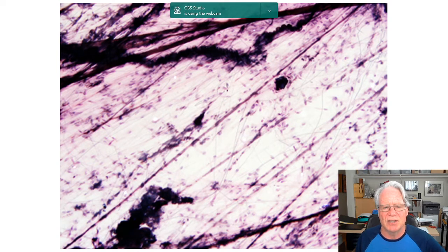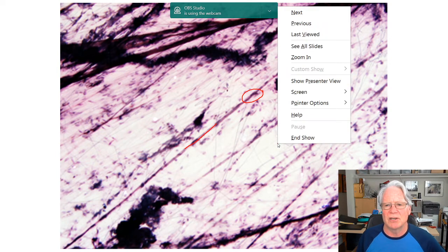Just know that there are many different types of cells found in this tissue. So again, another example, this would definitely be collagen fibers, and any cell that's connected to that would be a fibroblast. It's hard sometimes to know what is exactly the cell. That looks like it's a cell right there. It's probably a fibroblast, but beyond that, I can't really tell you what these cells are.